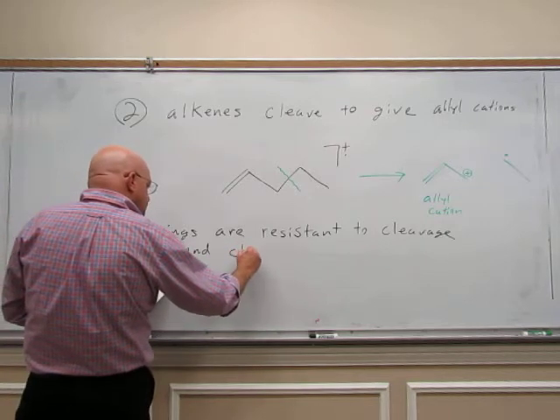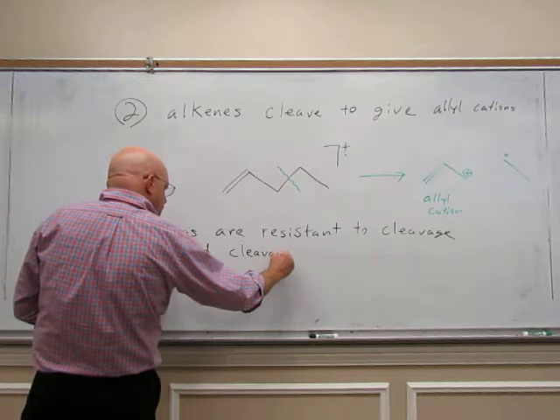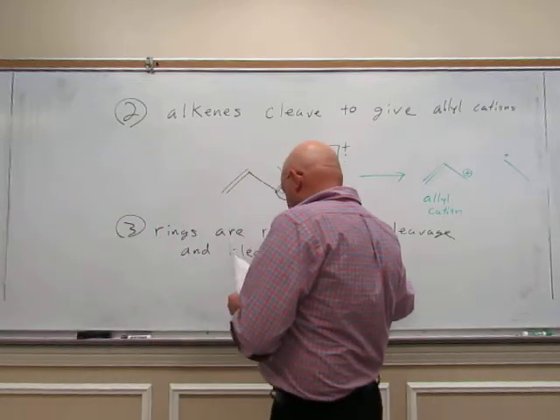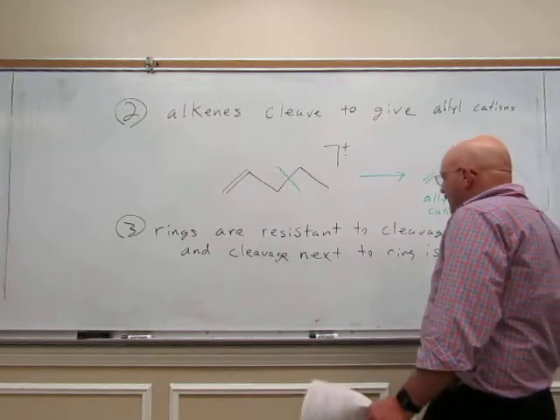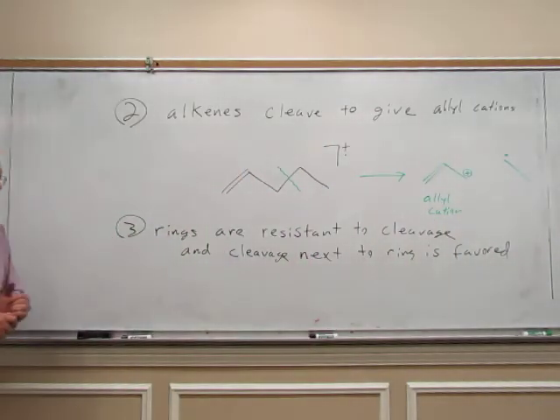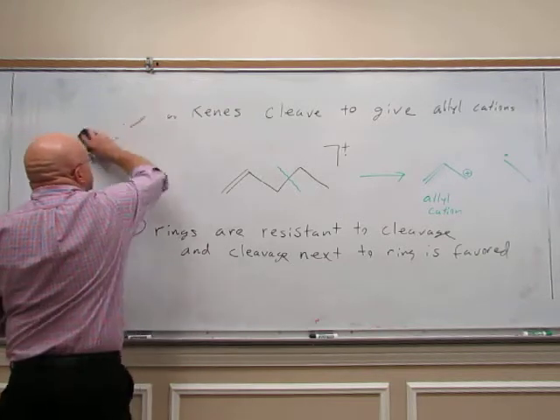Now there is an exception to that, and we'll deal with that in just a moment. So most rings, we like to cleave right next to the ring. So let's look at some examples of that.